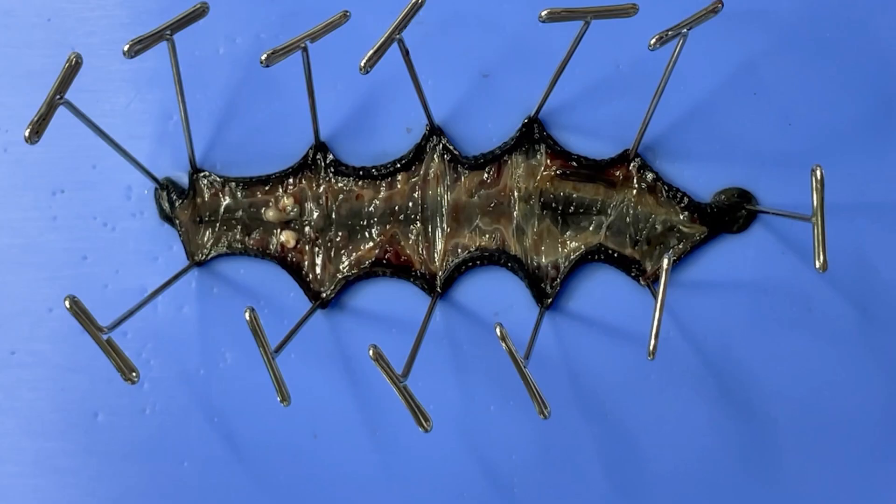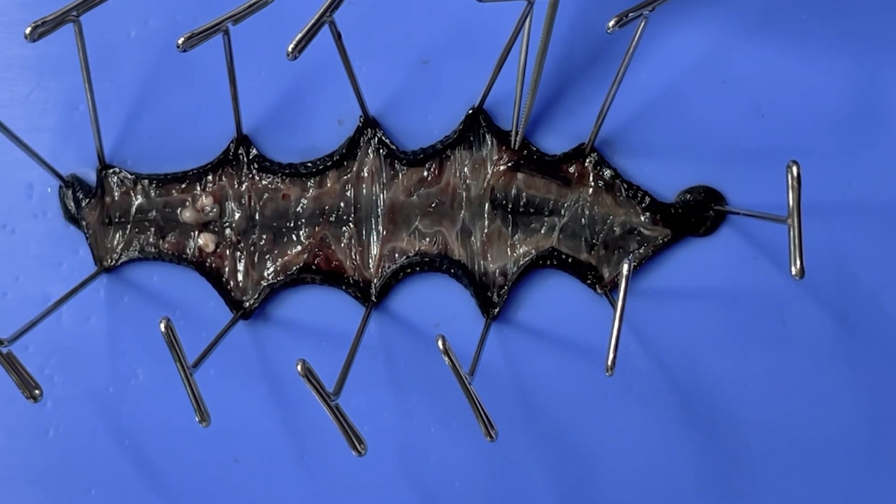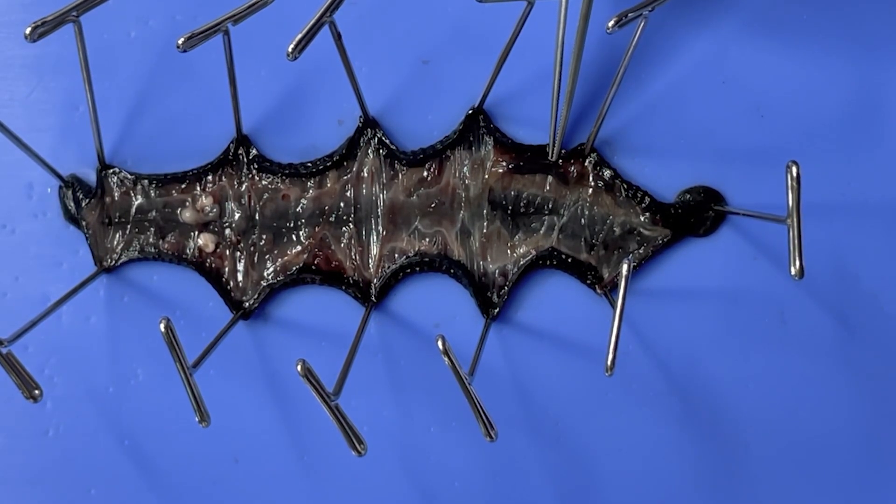This leech has been fasting for a long time, and there is almost nothing inside the digestive tract. However, you can see that there is still a little blood left here in the posterior ceca.